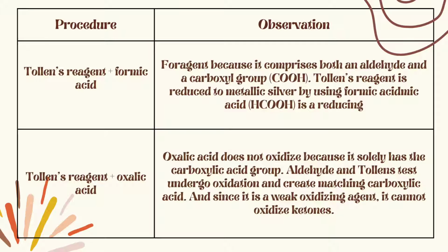Next is Tollens' reagent plus oxalic acid. In the observation, oxalic acid does not oxidize because it solely has the carboxylic acid group. Aldehydes in Tollens' tests undergo oxidation and create the matching carboxylic acid. And since it is a weak oxidizing agent, it cannot oxidize ketones.